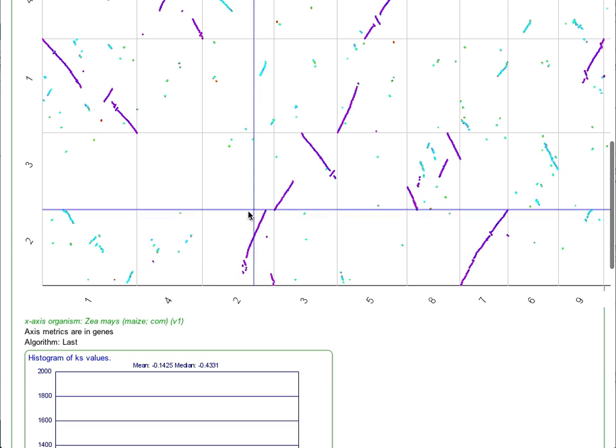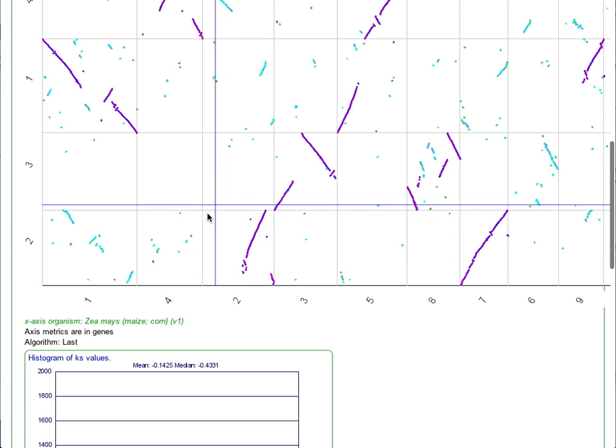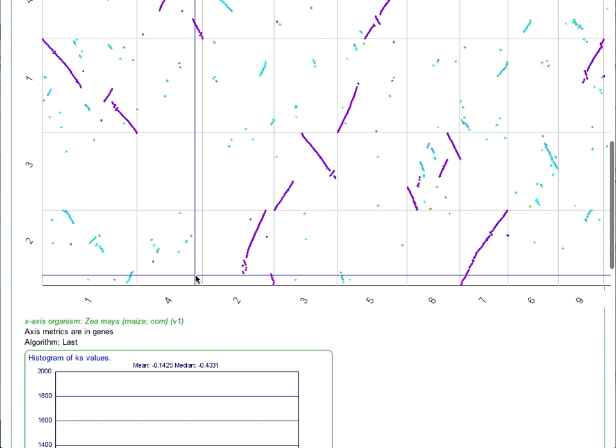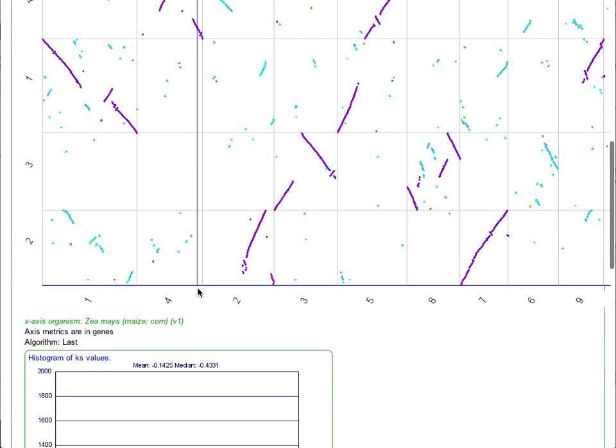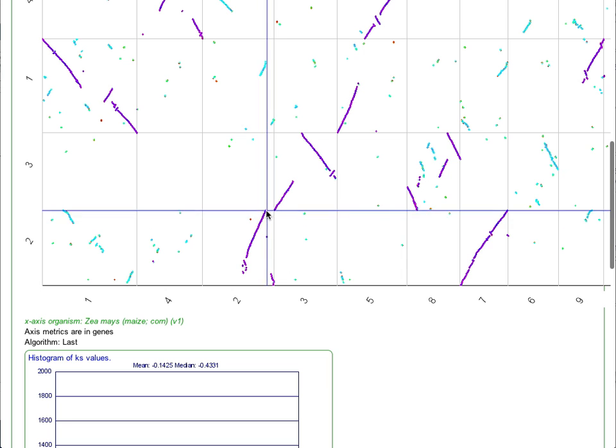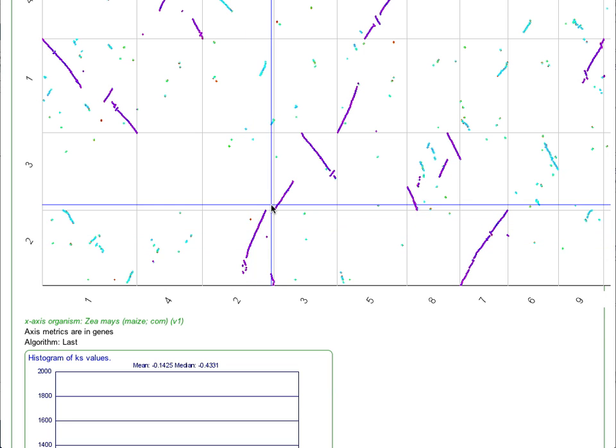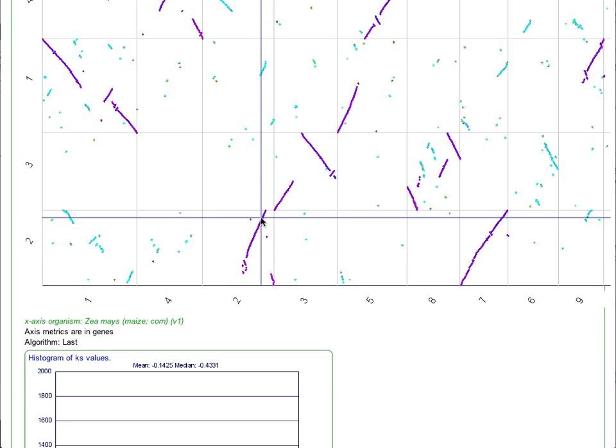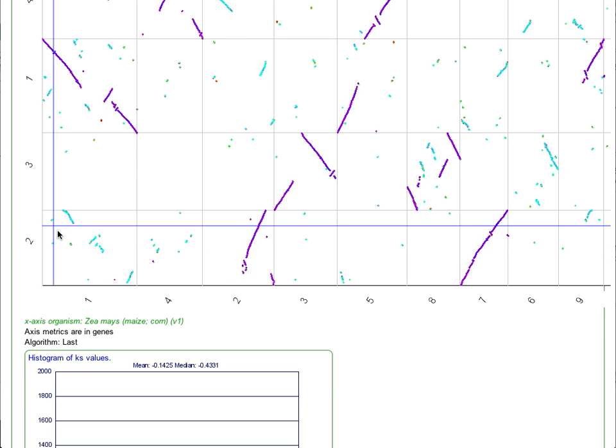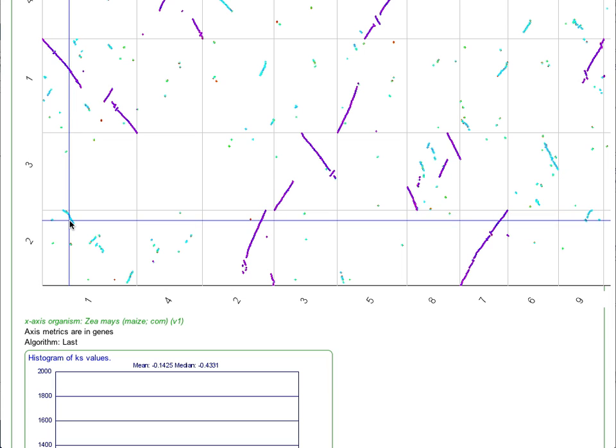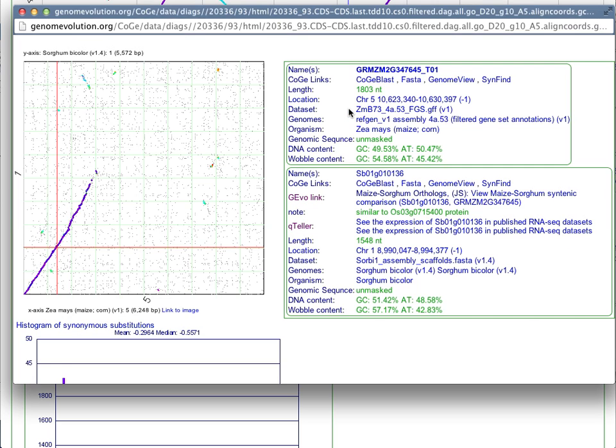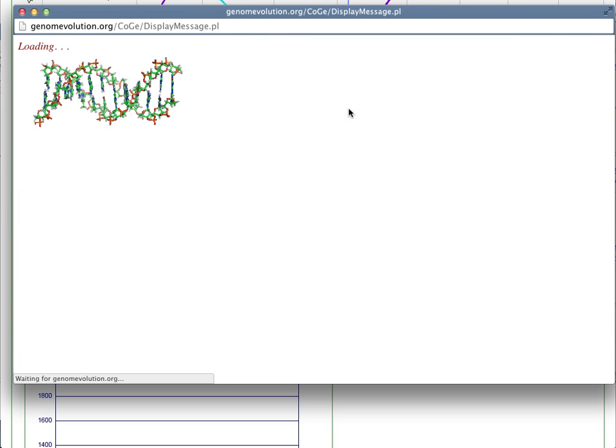These dots, these quadrants represent regions where we've compared two chromosomes, and these dots represent regions of synteny, with purple being derived that are orthologous, and these cyan regions derived from an older shared whole genome duplication event.